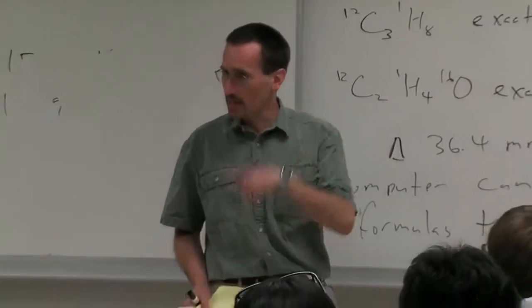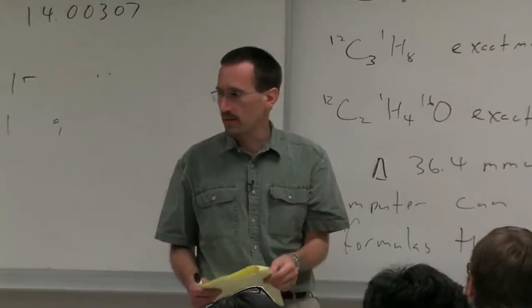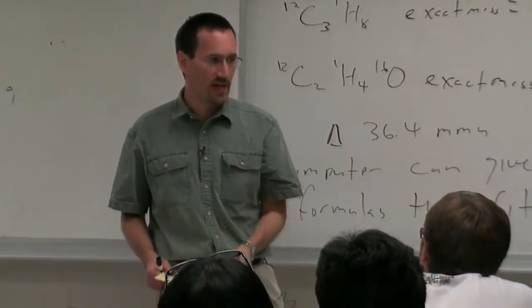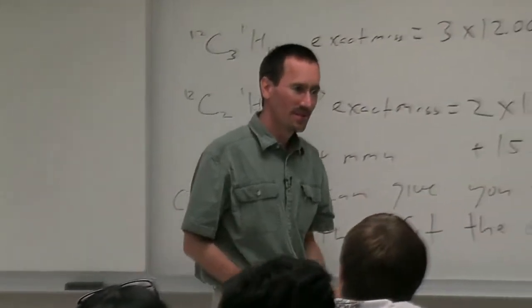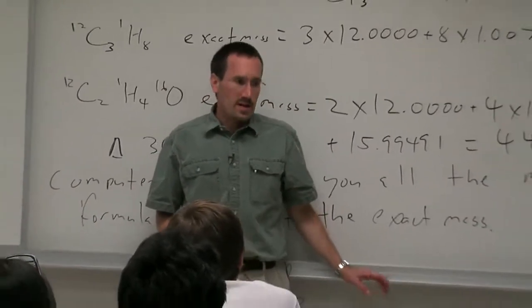And with that technique, because there you're spinning the ions around, and the longer you spin them, the more precision you get, you can get that level of precision. Is that another name for an ion trap? That's a similar idea, yeah.